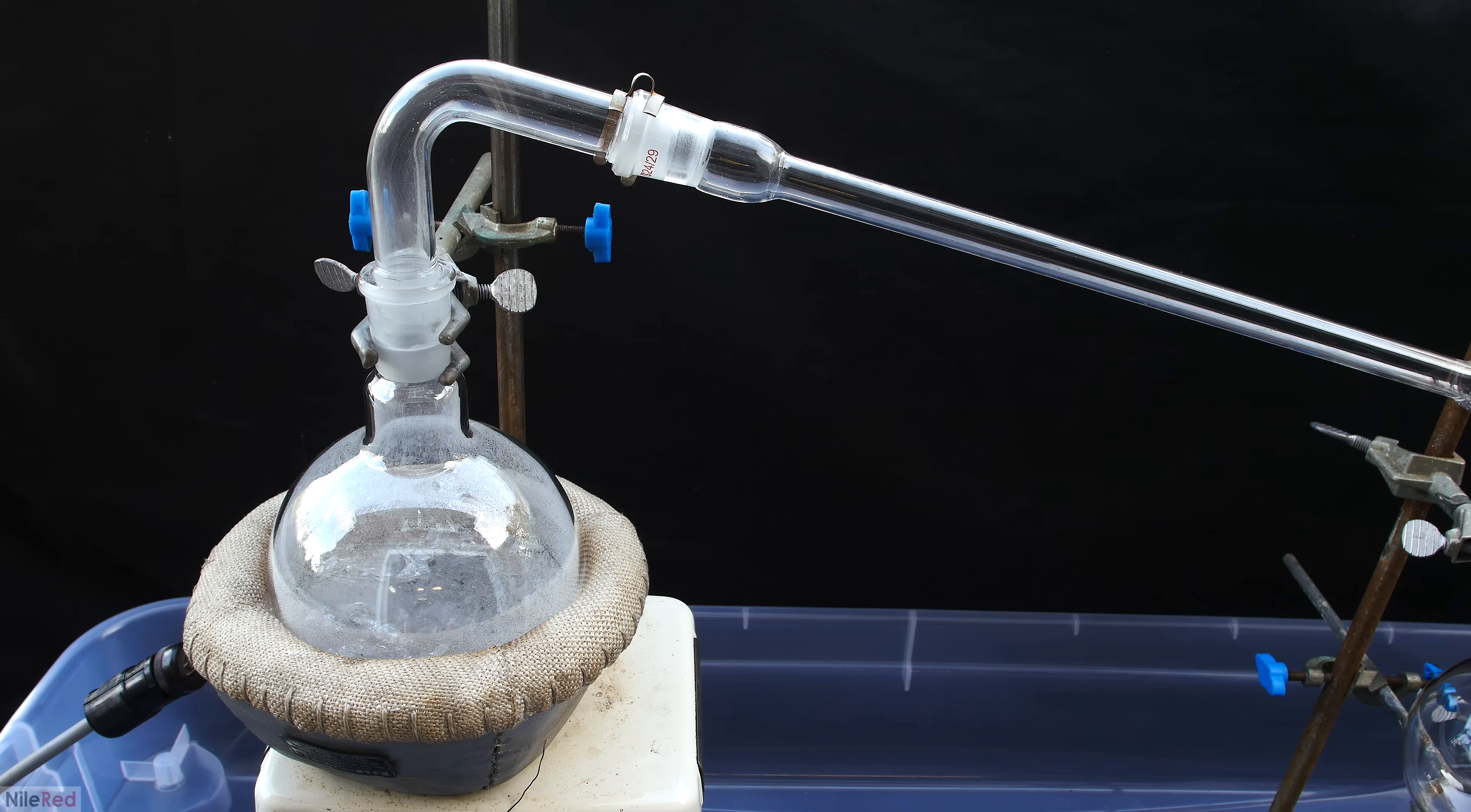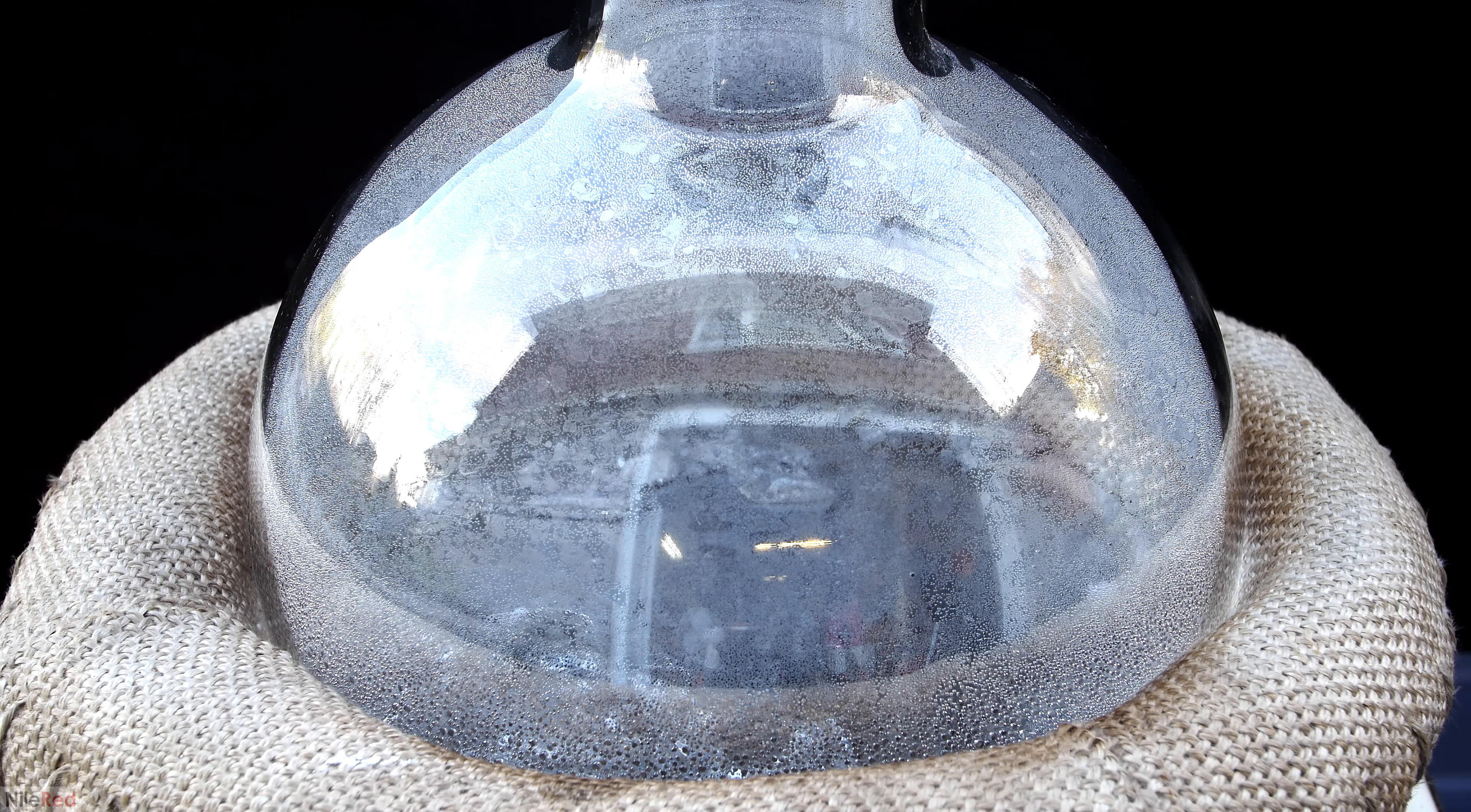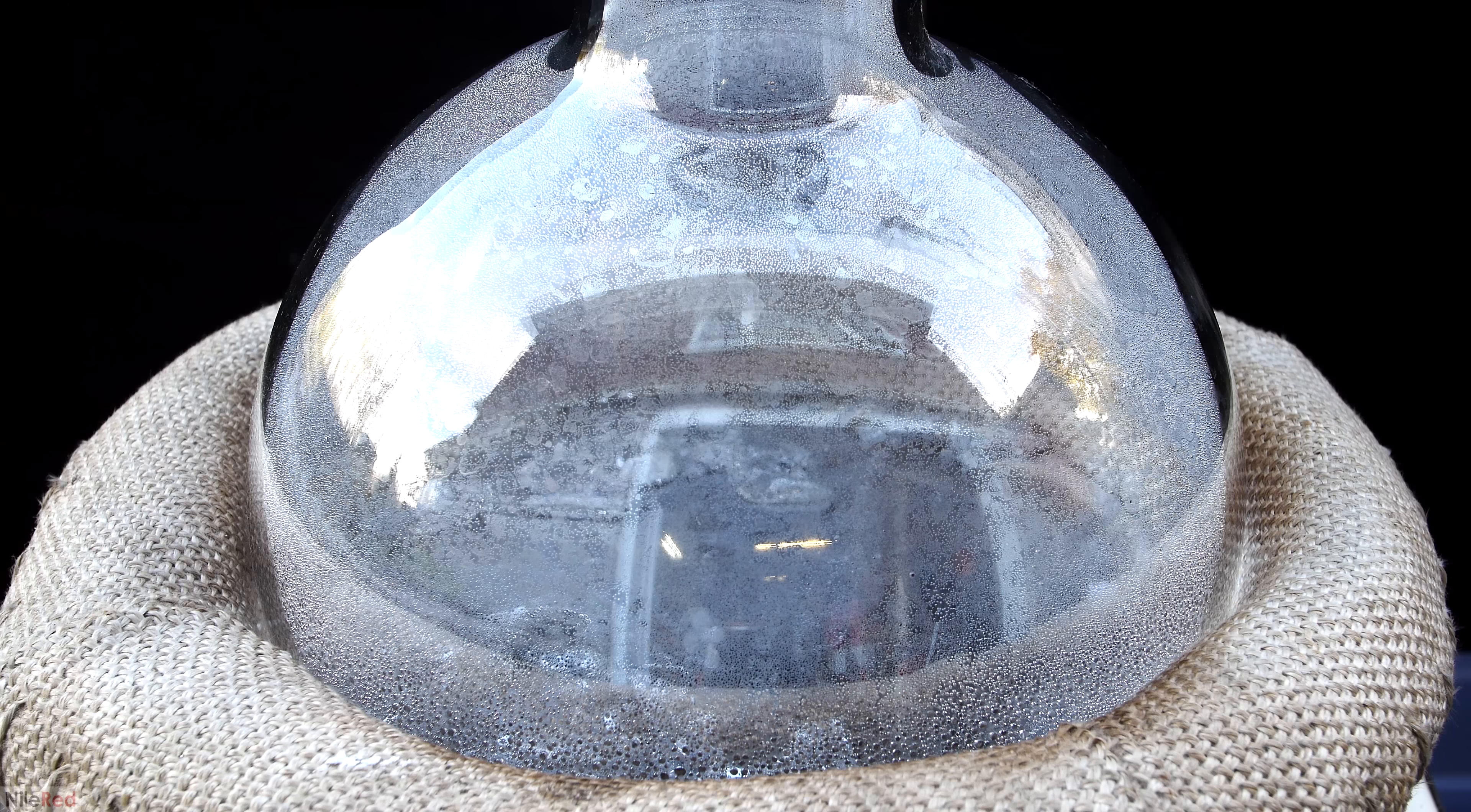Not long after I started heating things, mercury started to collect on the sides of the flask. This made for a very nice and reflective surface, so you can actually see my house and maybe even the camera. This doesn't last for too long though, and once the mercury starts to boil, the flask should clear up a lot.